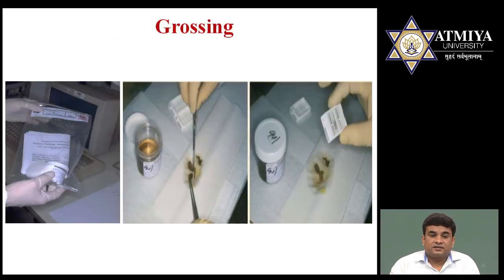If you see the pictures, there is one leaflet attached with the tissue sample, which is taken in the plastic container, right? This leaflet contains all the details. Then you take the tissue sample out of the container, study it, and cross check everything against the tissue sample. If everything is fine, then you transfer it to the tissue cassette for the next step of histopathology processing.